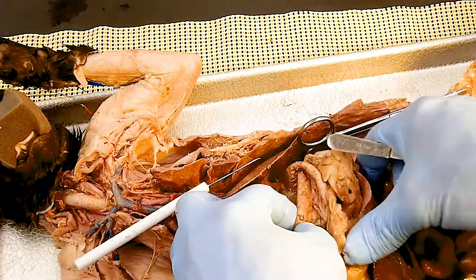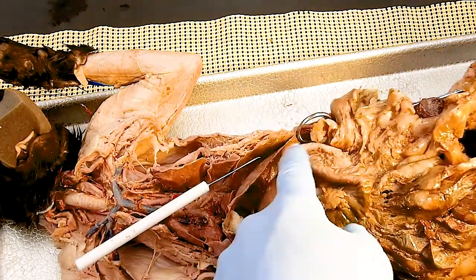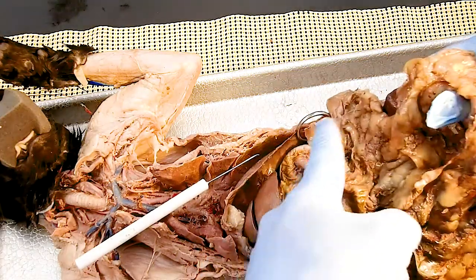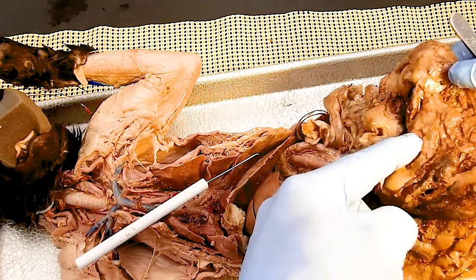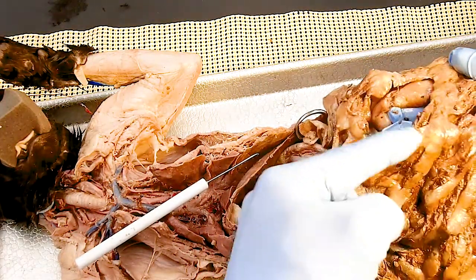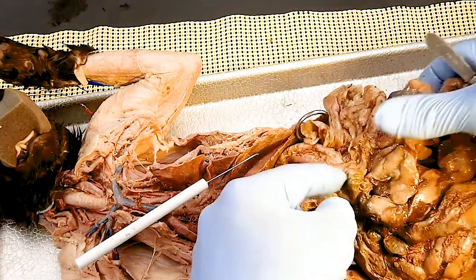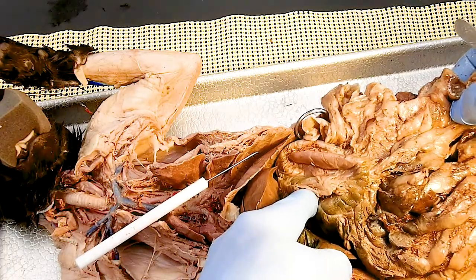Attached to the greater curvature of the stomach is this mess right here. Here's the stomach's greater curvature. This big membrane is the greater omentum. It's protective. It's also a fat storage organ. All this fat you can see, kind of pale looking stuff, is adipose tissue or fat. So that's hanging from the greater curvature of the stomach.